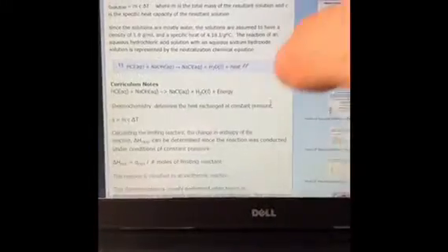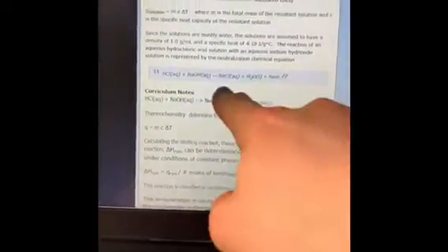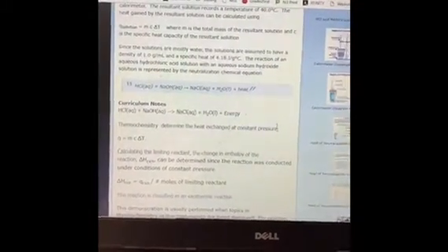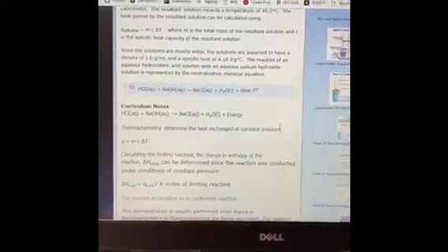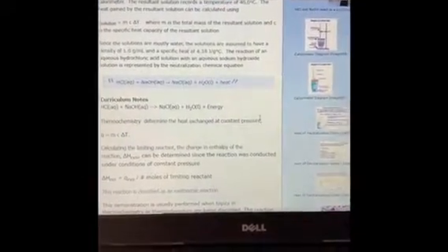And now from this spot, and this is on the U of Oregon website, once we have that reaction complete, we would put this solution of the sodium chloride in water in an ice bath, much like we did with the alum, and we would see the solution quickly become saturated and the smaller sodium chloride crystals precipitate out.